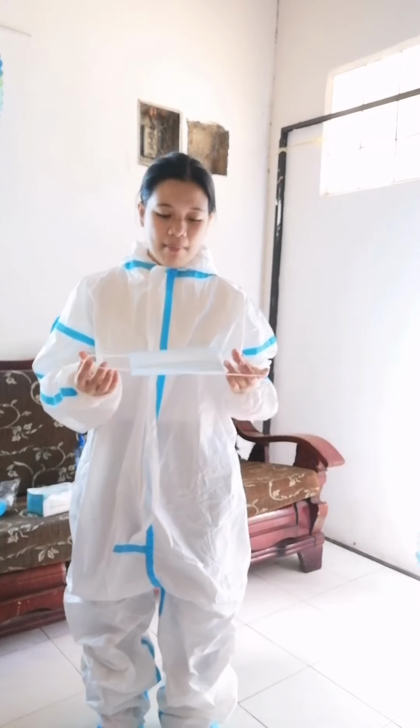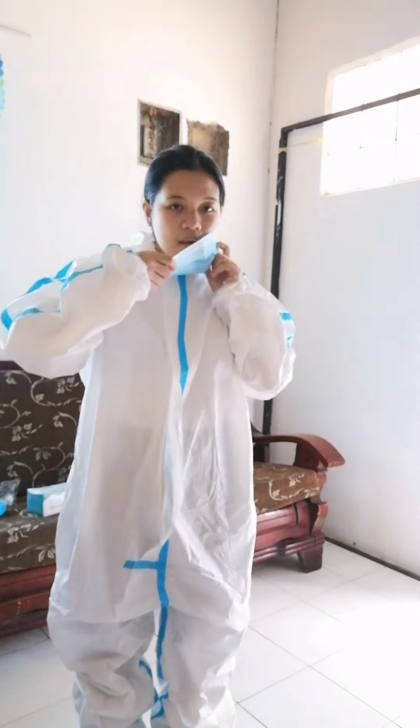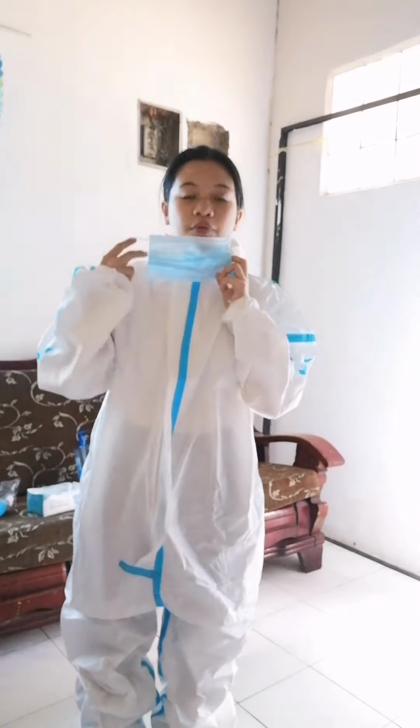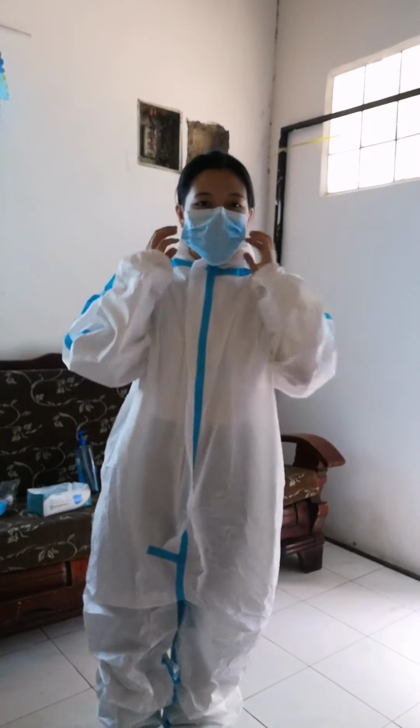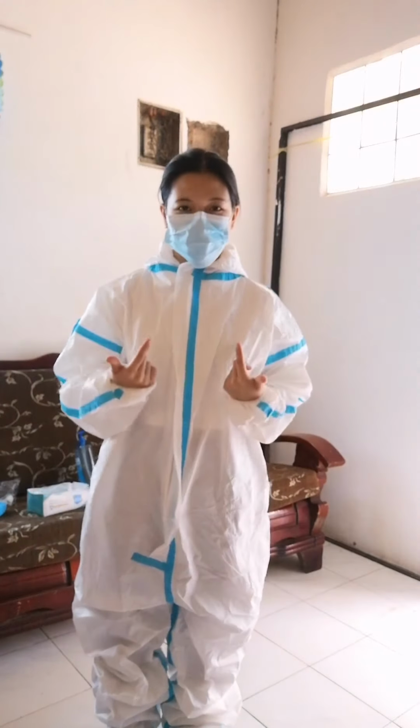Next is to don our mask. So we need to fully cover our face. This is mainly to prevent it from falling or dropping down. Since I do not have the mask that is fit for the PPE, I will improvise using a surgical mask.